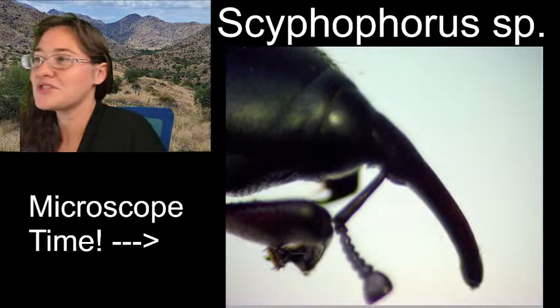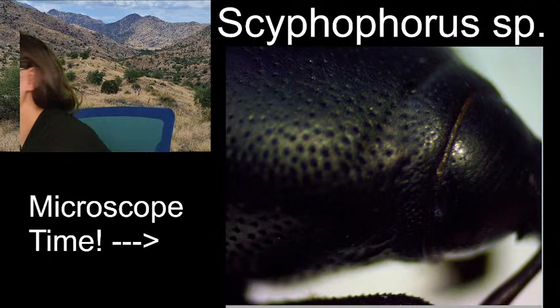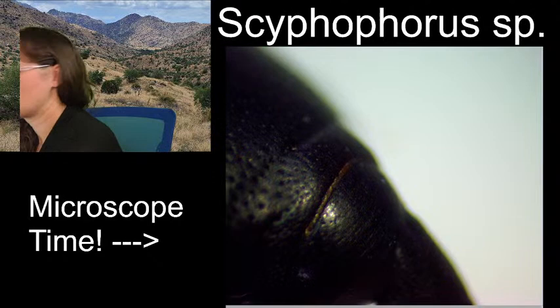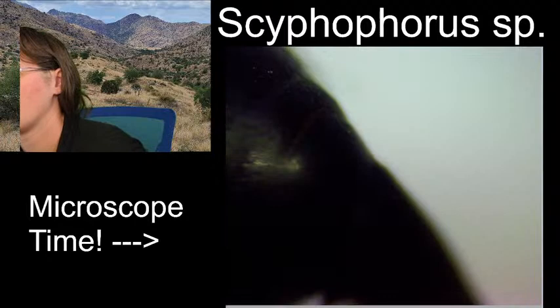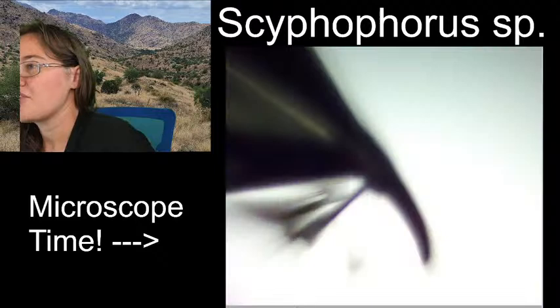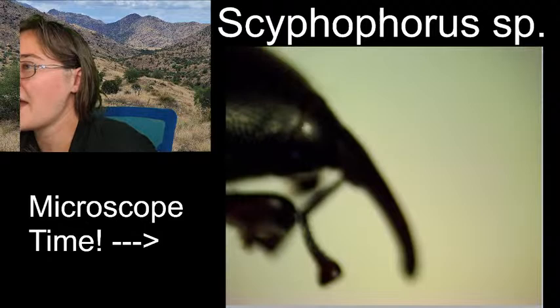And I was just trying to show the eyes of this beetle, but it's being a little trickier than I thought it would be. It's just a black beetle. I could make the light not as bright. I wonder if that would add to the contrast.